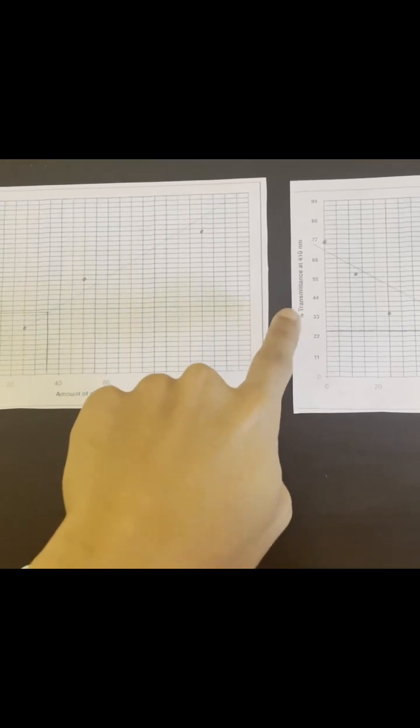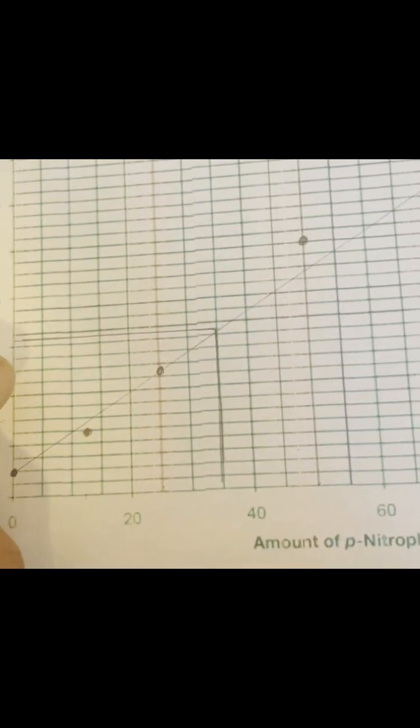These are the graphs I made from the data. You can see that this one is absorbance versus concentration. This one is percent transmittance versus concentration. And you can see that I made a line of best fit for the standard curve, and that helps me estimate, because this is the absorbance of the experimental sample, and we can just use the line of best fit and estimate the concentration.